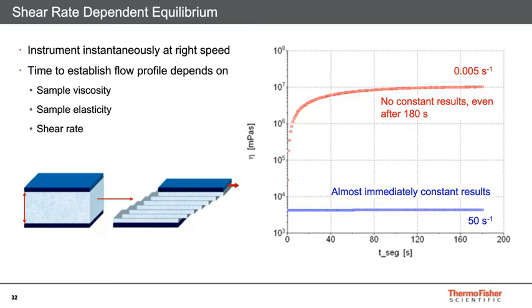Okay? So really we have to match how we're collecting data to the time response of our material. If you're working with low shear rates, relatively higher viscosity, you need to give enough time for that flow profile to develop and collect high-quality data.